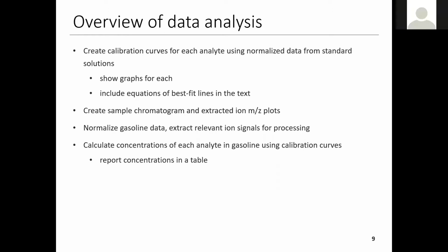Yeah, you should export the data from the example files to generate some example chromatogram and mass spectrum peaks, like I talked about last week. But the actual data that's in those raw data files does not correlate to the integration reports, just because that experiment was really old and I wanted to give you guys some more realistic data.